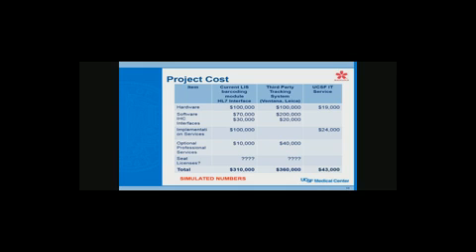We have a dozen or so administrative people, supervisors, all kinds of things. So we ended up getting well over 100, about 120 barcode scanners just to be able to use the system. So when you look at numbers like that, the numbers go very fast. But you're looking at the cost for the software, the cost for implementation of the software, which is basically the implementation process.